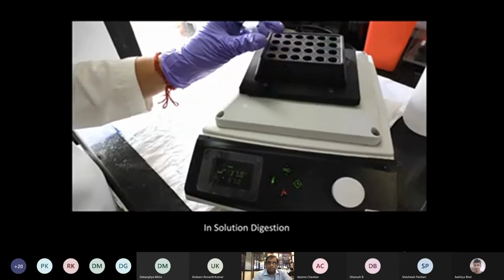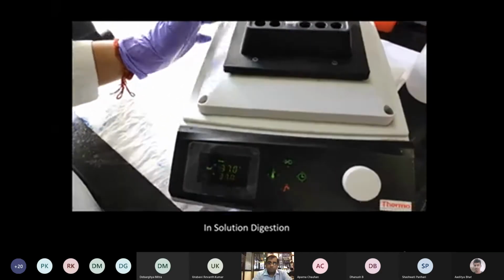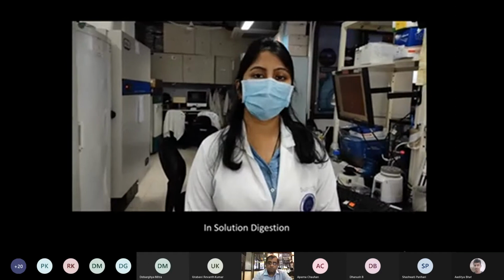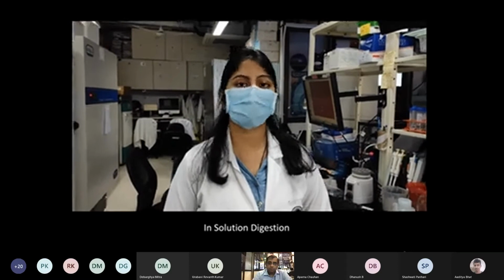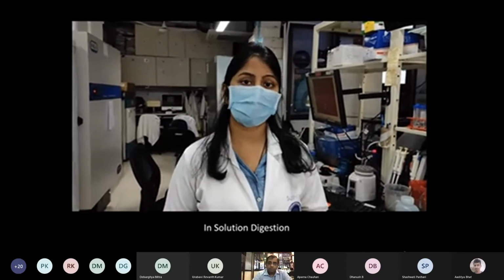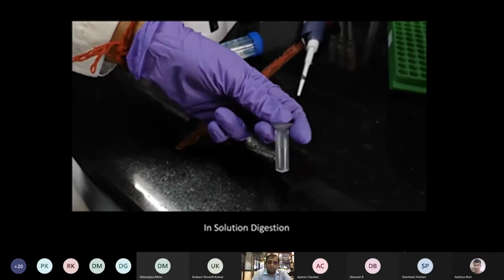And finally, for optimum protein digestion, the samples need to be incubated at 37 degrees for around 16 to 17 hours. After 16 to 17 hours of incubation, the protein sample is completely digested, and then the sample is dried in order to get the peptide sample. These dried peptides can be taken further for mass spectrometry.